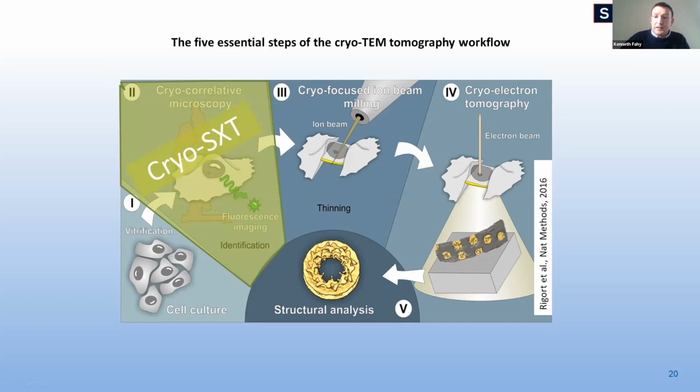a whole cell context. Other workflows are possible as well, such as using freeze substitution and resin embedding after soft X-ray tomography, and then using room temperature TEM. At the moment, we have 4 independent projects with 4 different groups looking at different variations of this theme, essentially.